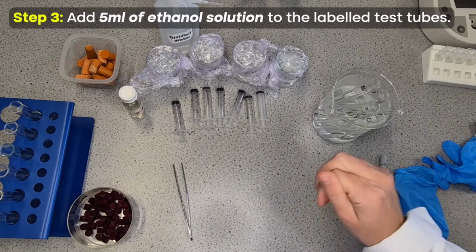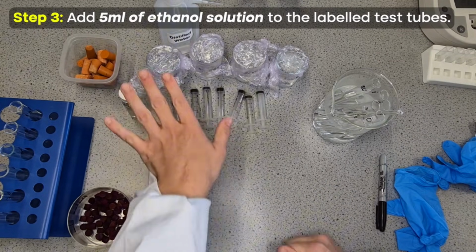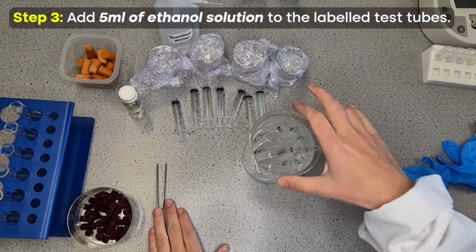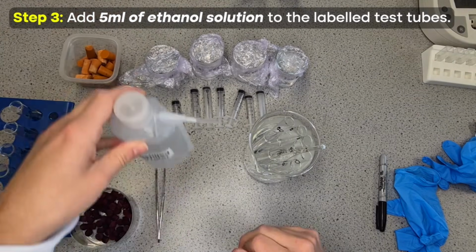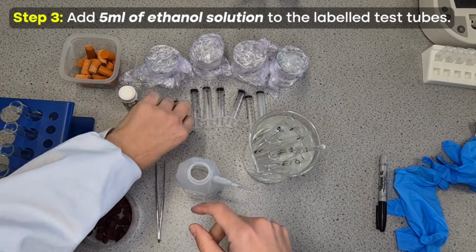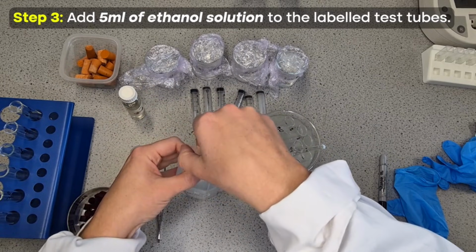So next, I'm going to add 5 millilitres, which is the same as 5 centimetres cubed, of each of these pre-prepared concentrations to the correctly labelled test tube. So I've got my distilled water here. It would actually be easy if you had another beaker, you could pour that into it, because you might not have a syringe that can fit all the way down.